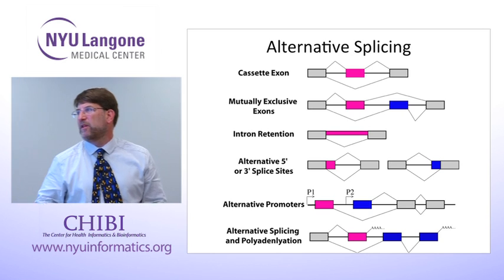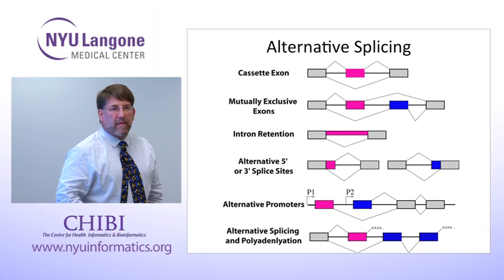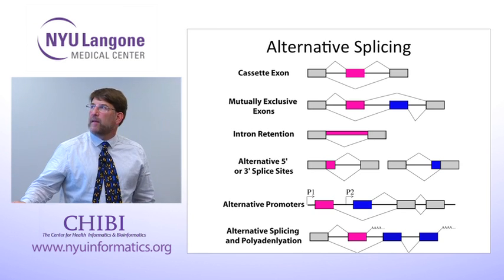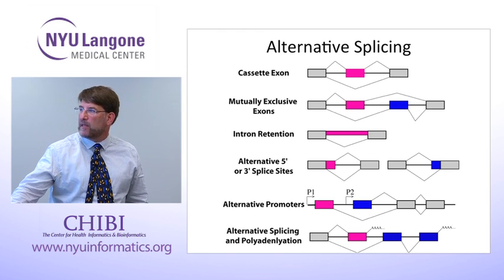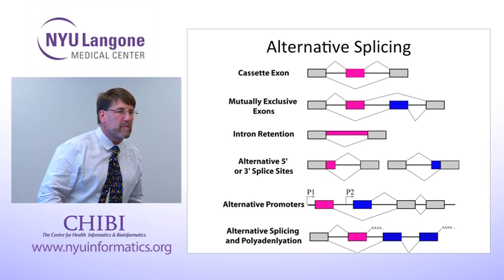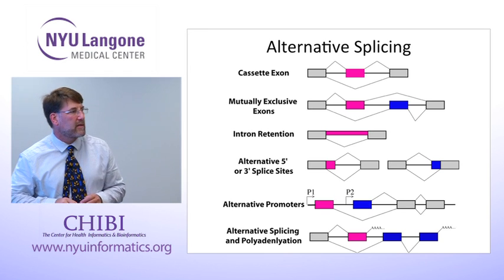I'm going to talk really briefly about this, although lots of people bring us alternative splicing problems or questions. The theory is that genes are spliced differently. Certain exons are used sometimes and not other times. There's upstream and downstream exons. There are internal positions internal to the exon or internal to the intron. That's where splicing can occur. The net result is that there's a lot of different transcripts in your total RNA isolation mix.